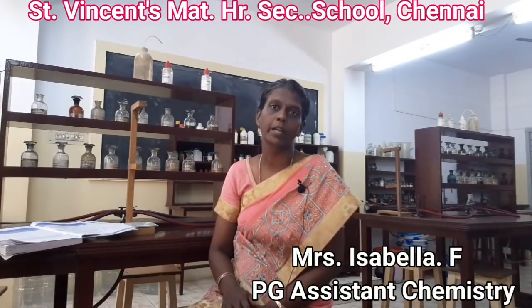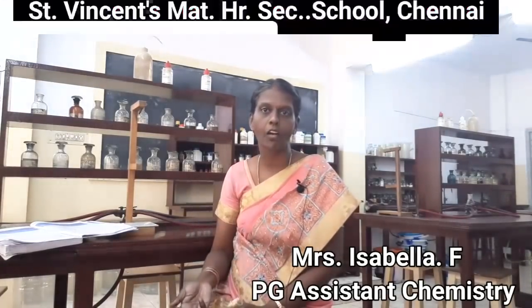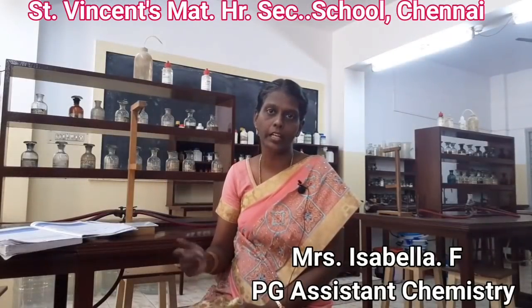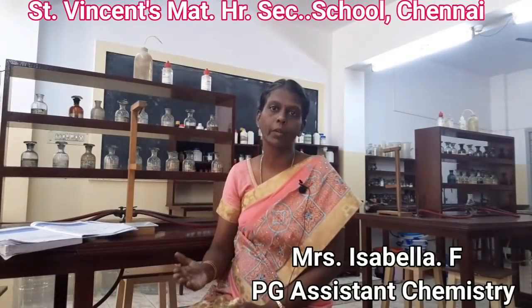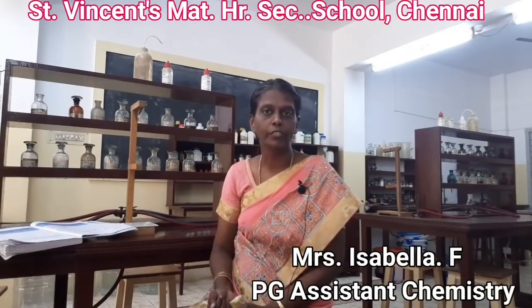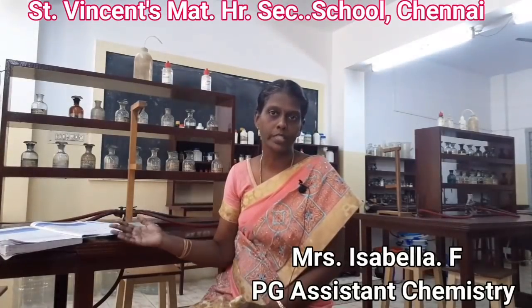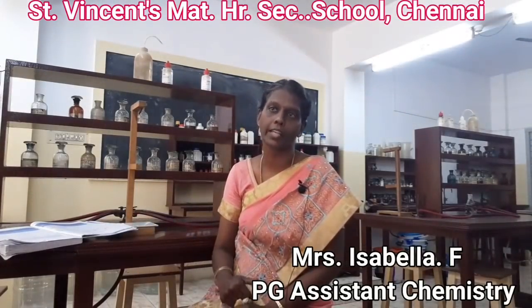The last 2 experiments are called acidimetry, wherein you are going to use an acid and a base. For these 2 titrations, an indicator will be added externally, and accordingly there will be a color change. So an indicator, for example, either methyl orange or phenolphthalein is added externally, and according to it there will be a color change which is given in the short procedure. So you can follow the short procedure which is given in the textbook, and the method we have seen now for all the remaining 4 experiments.